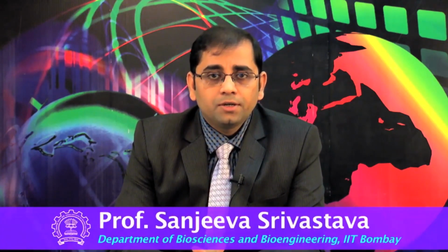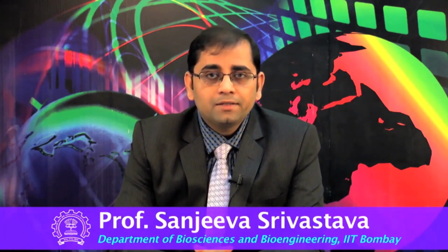In the next lecture, Dr. Karl Klauser will conduct hands-on sessions to help you interpret the MSMS spectra manually.